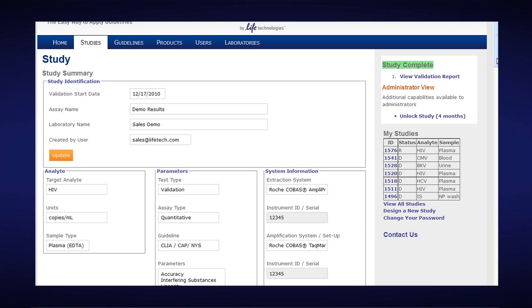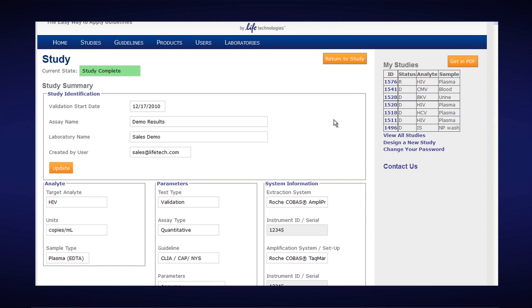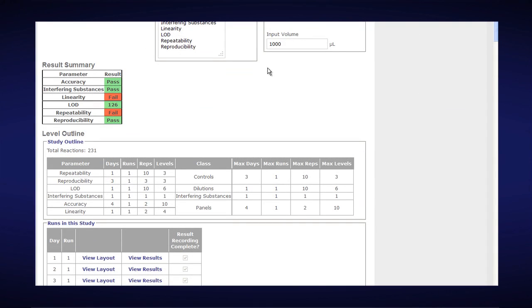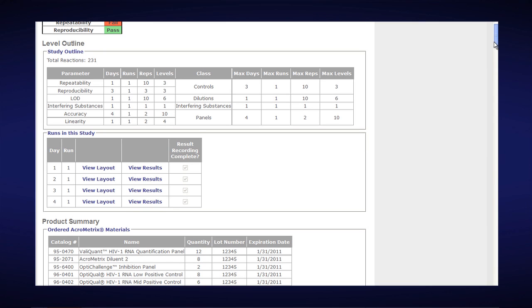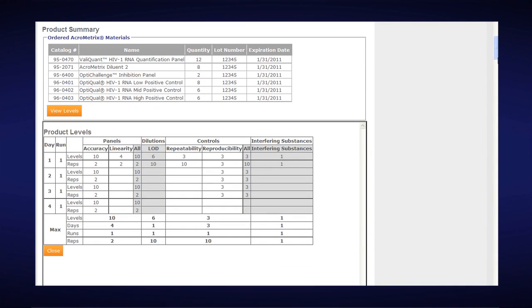To view the validation report, I'll click on View Validation Report right now. It shows an online version of the completed study — all the study identification information plugged in during the first four easy steps, and a high-level results summary. For demonstration purposes, we've shown that linearity and reproducibility failed, highlighted in red. Normally everything would show a green pass. It also has all the details of the study outline, the runs, products used from Acrometrics, the different product levels, and all data from the acceptance criteria.